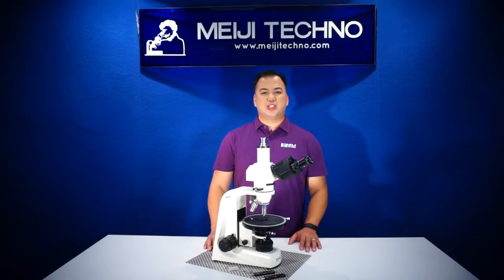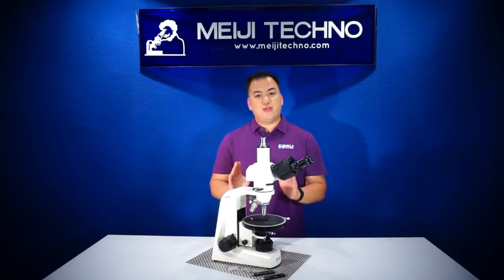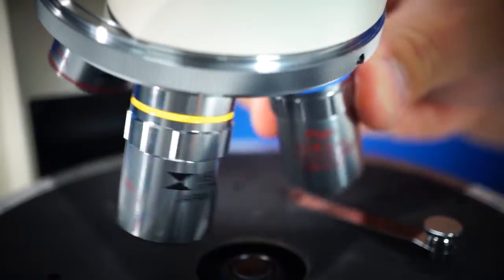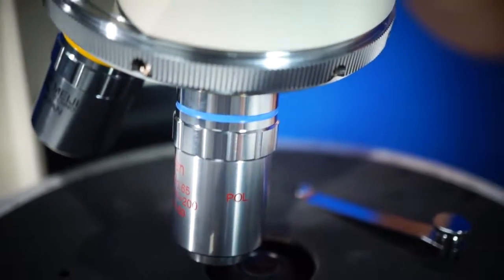The MT-9000 series is normally equipped with infinity-corrected, plan, strain-free 4X, 10X, and 40X objectives. All can be smoothly rotated on the ball bearing quadruple nosepiece, as you can see here.